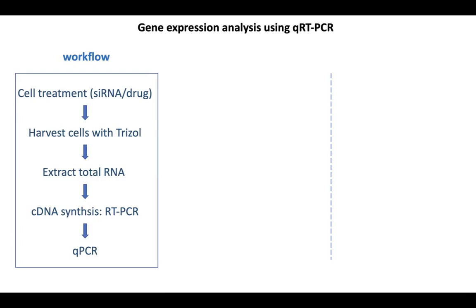To ensure high-quality qRT-PCR analysis, you need to know the critical steps that have important impact on the final readout. Now, let me walk through the most important tips during this process.